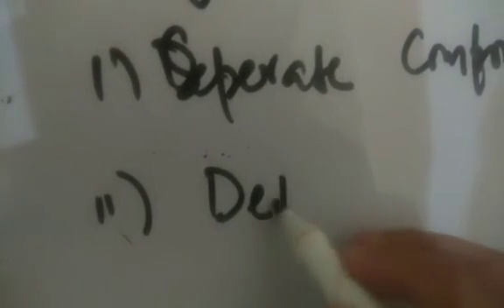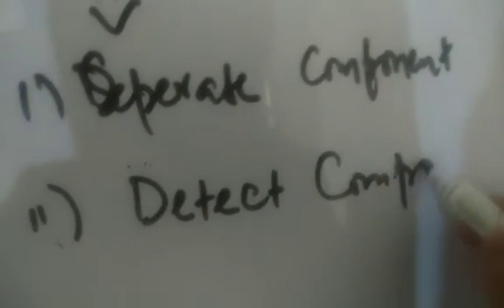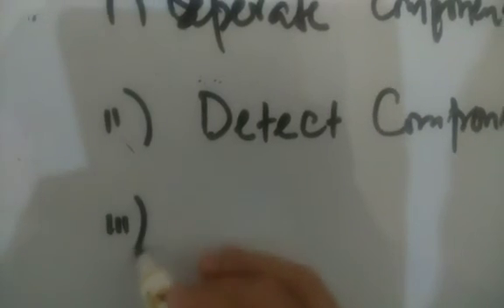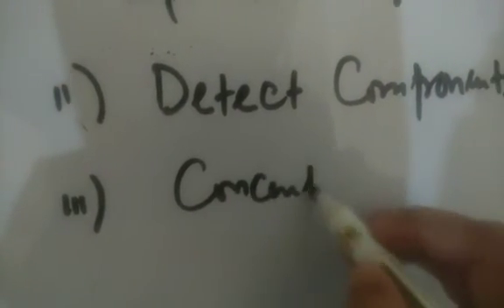Now what we do with HPLC is that we are separating the components. Number one, we can separate various components from a mixture. Number two, with the help of the UV detector, we can detect which compounds they are. Number three, we can also quantify them. Now, this is very important: we can determine their concentrations also.